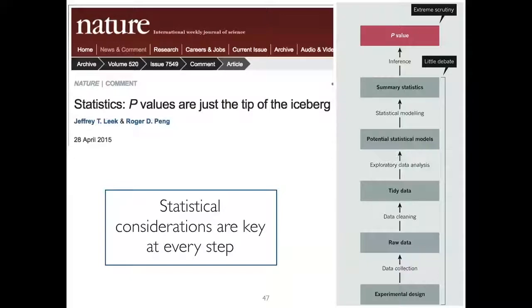For example, recently someone came up to me and said, you know, this multiple testing adjustment, it really doesn't work for me very well. So my p-values were small and looked good, but then I adjusted for false discovery rate and nothing is significant. So something is wrong with this false discovery rate adjustment. And I'm like, wait a minute. So you designed the experiment, right? You collected the data. You exported the data to whatever tool, right? So you processed the data, right? You summarized the data, missing values. You modeled the data, got p-values, adjusted. It doesn't work, and you blame the adjustment. So there are all these other things that we had to do, right, to get to the adjustments of p-values.